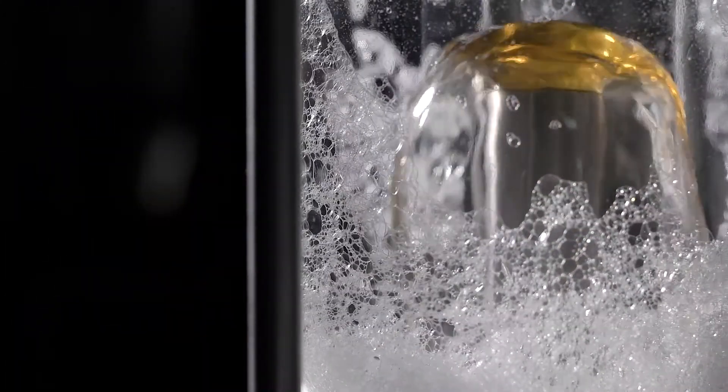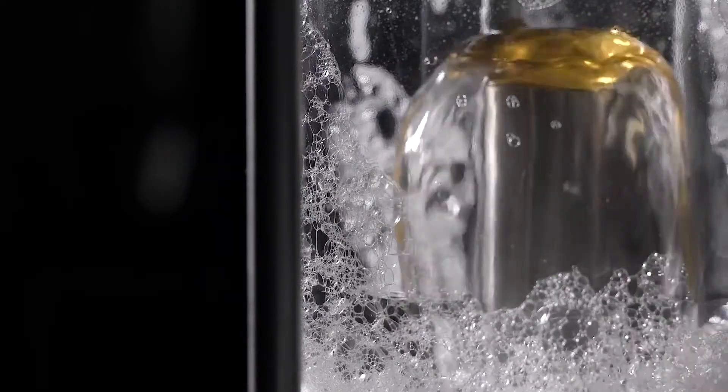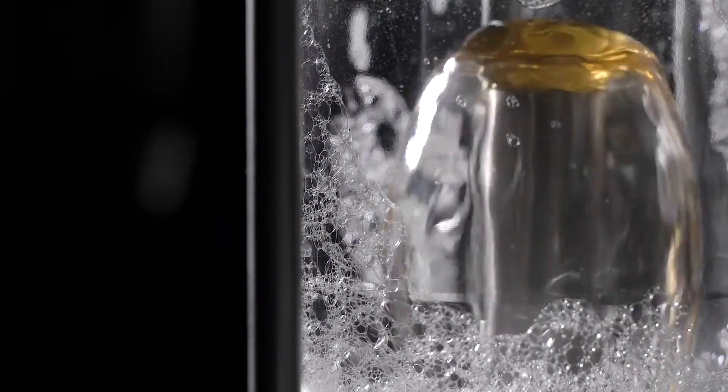We carry out filtration regularly in our homes using a strainer, but for scientific purposes we will use a filter funnel and a filter paper.